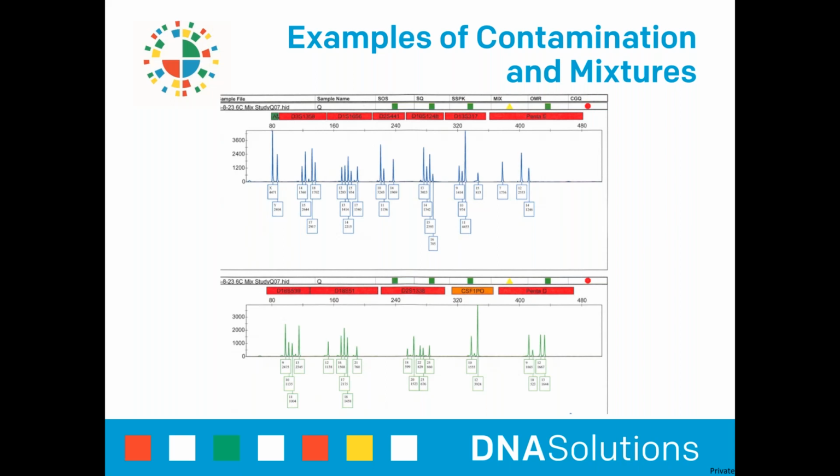Samples we receive are cut, sealed, and labeled, one at a time, and then processed by case. Laboratory staff members always wear PPE to prevent the possibility of their own DNA contaminating the samples. When mixtures are obtained, they are cross-referenced to the profiles of all DNA Solutions employees to confirm the contamination was not caused internally.